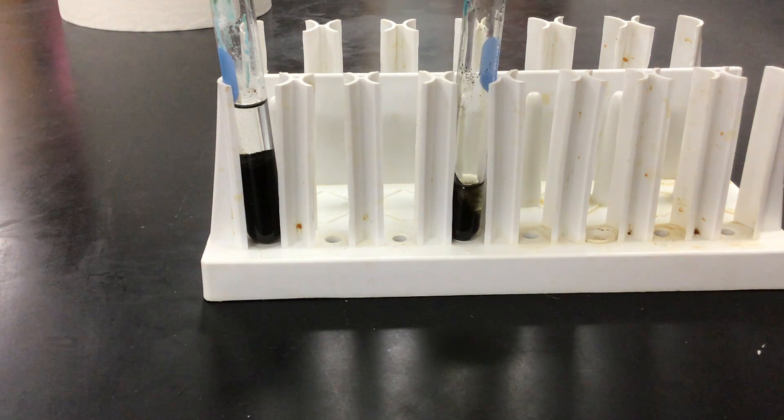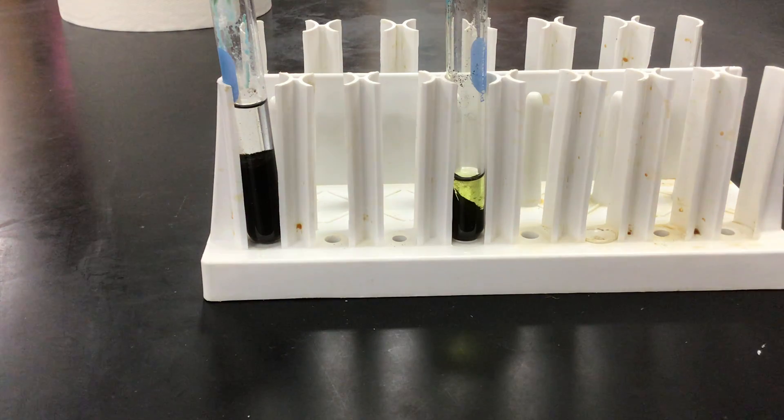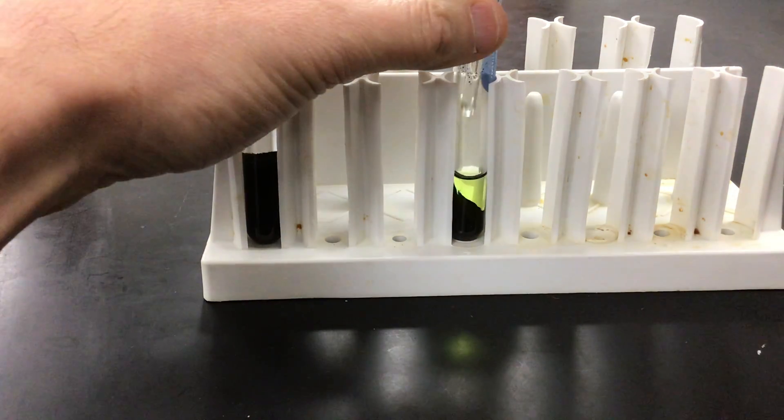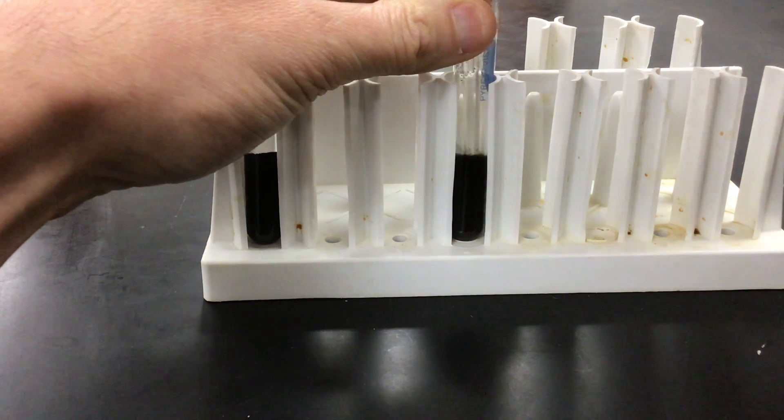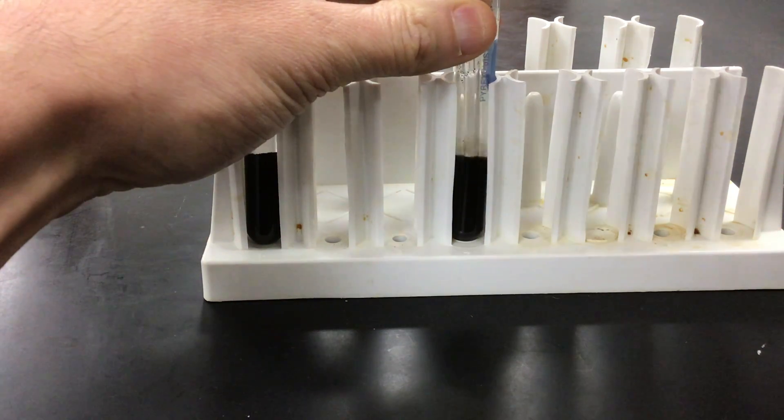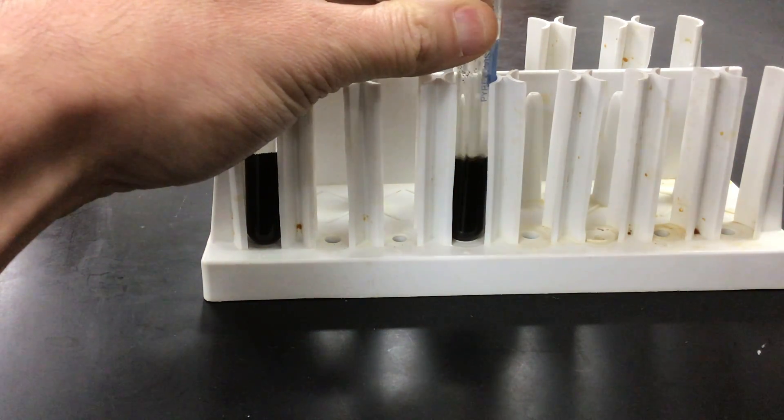I'm going to go ahead and add a small amount of HCl. You can already start to see a color change taking place. We'll stir it as we mix the acid together with it.